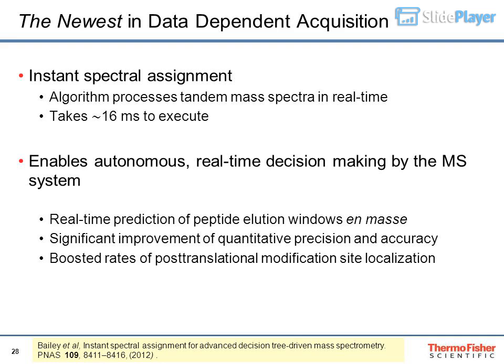The DDA sampling strategy offers elegant simplicity and has proven highly useful for discovery-driven proteomics. Of recent years, however, emphasis has shifted from identification to quantification, often with certain targets in mind. In this context, faults in the DDA approach have become increasingly evident. There are two primary limitations of the DDA approach. First is poor run-to-run reproducibility, and second is the inability to effectively target peptides of interest.